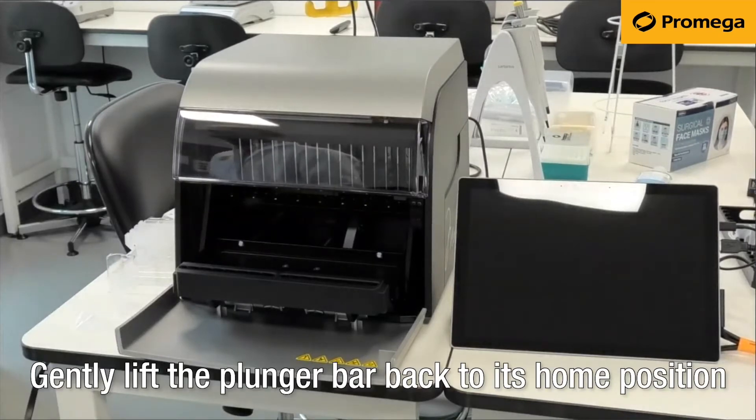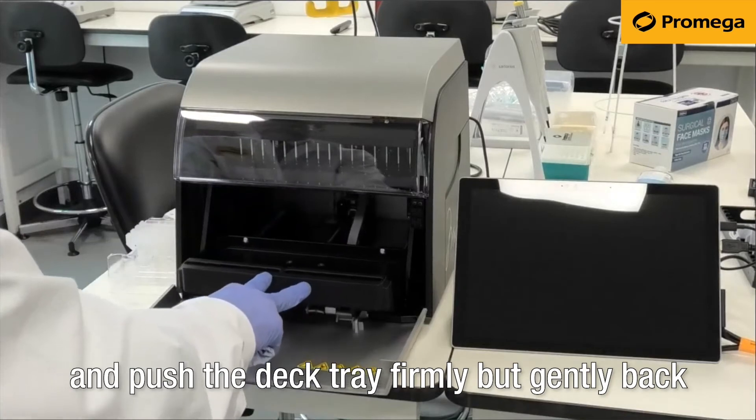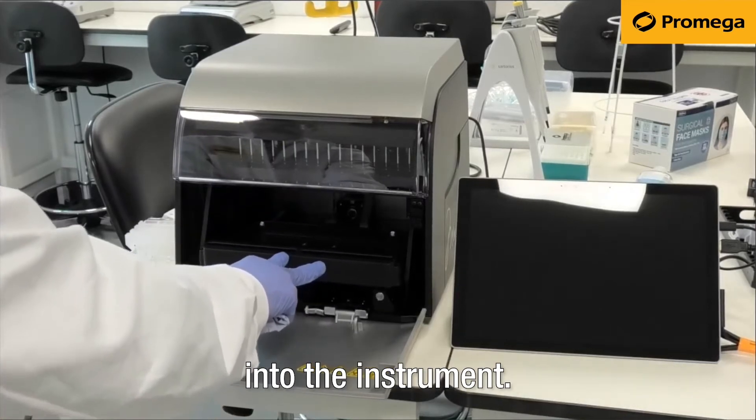Gently lift the plunger bar back to its home position and push the deck tray firmly but gently back into the instrument.